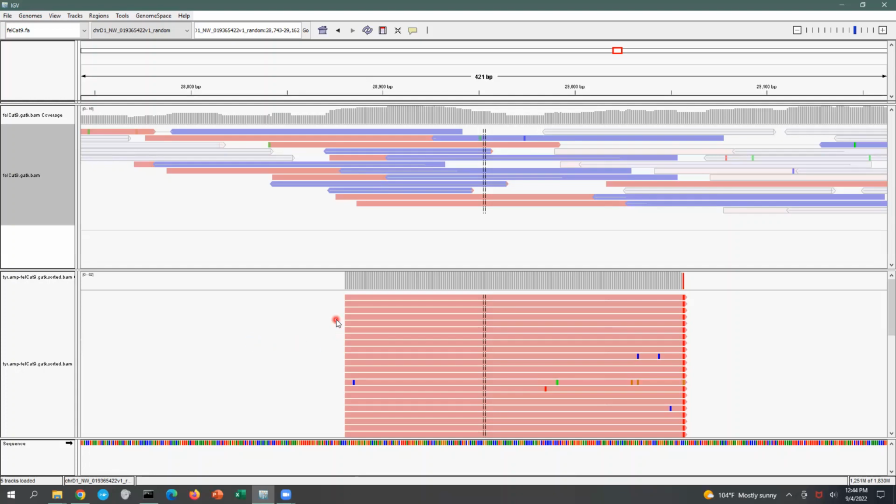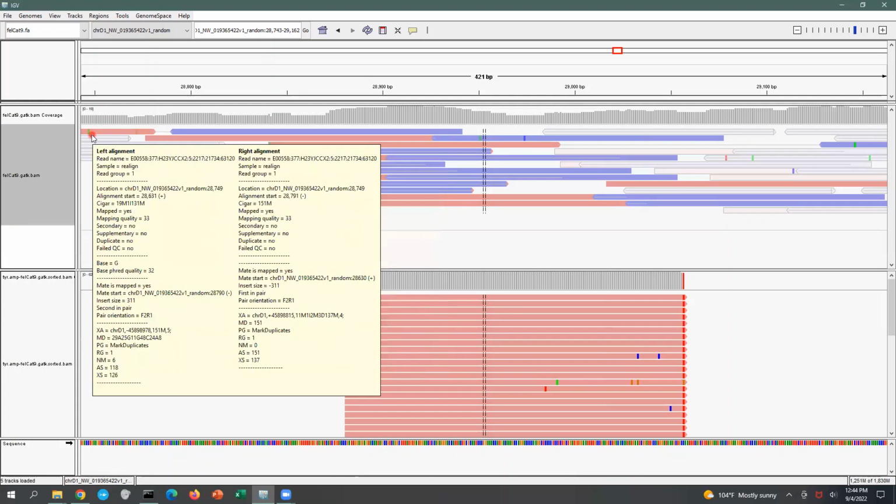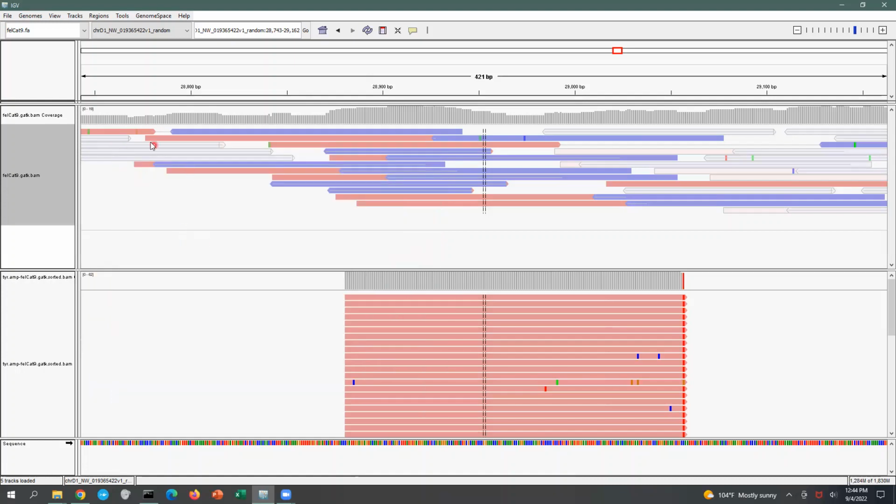But essentially, to make sure you understand the difference between those library types, if your cat's genome is a relatively good match for the reference genome, you should get somewhat even coverage across all positions in the genome. And then with Amplicon-Seq, you should get high coverage where you've designed those primers, and you should get little or no sequence elsewhere in this particular view. You see it's no sequence, no gray bar here or here. I did not sufficiently well explain the difference between 0 copies or 2 copies conceptually.